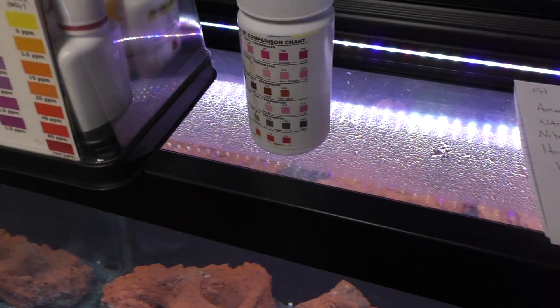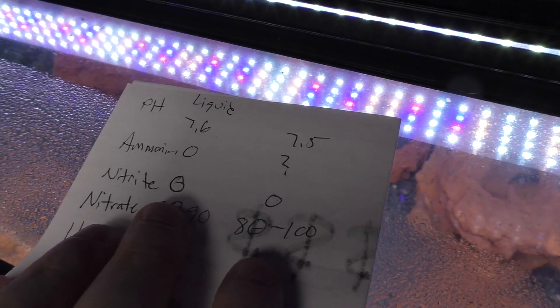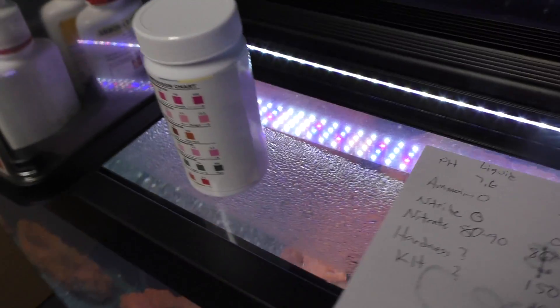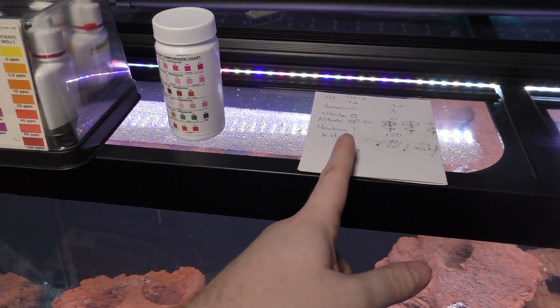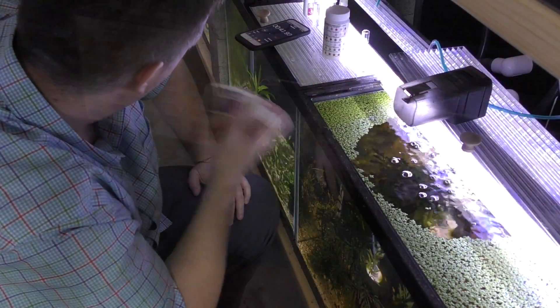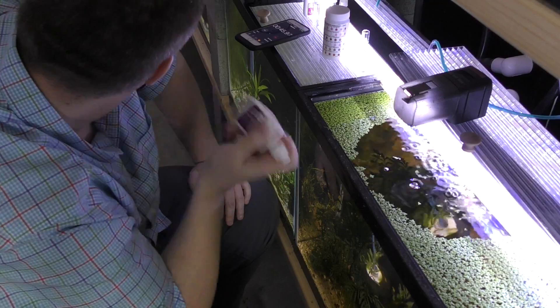With the actual comparable parameters — pH was very, very similar; nitrite was an exact match; and nitrate was very similar as well. So I kind of make it a toss-up. What I do like — and I didn't write that down — is time. This took me seven or eight minutes; this took me one minute. With multiple tanks, I do think time is a factor, at least it is for me.